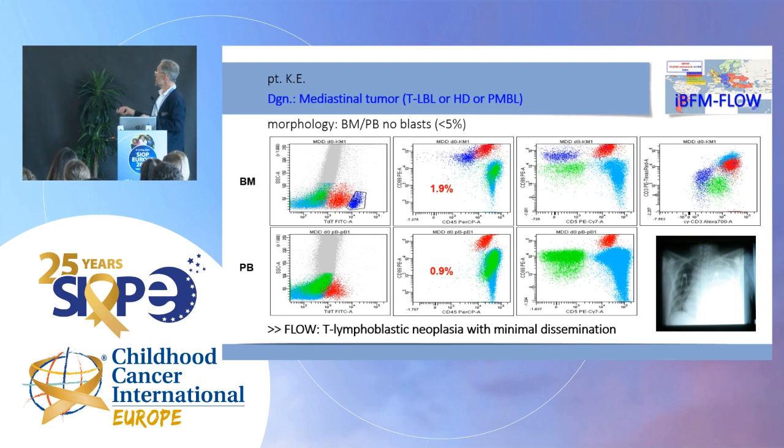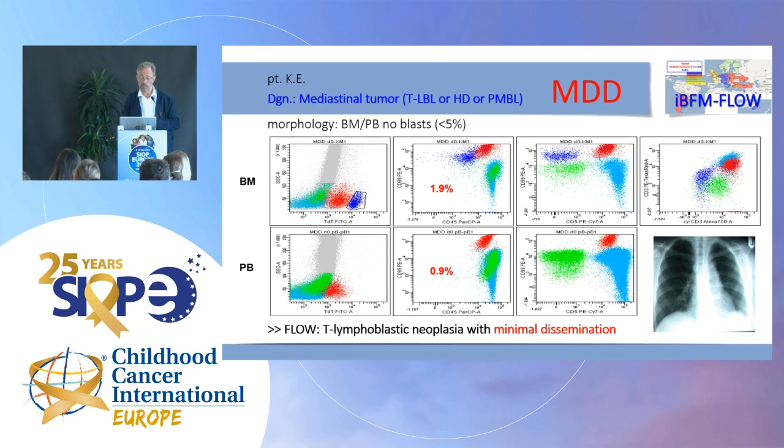So I'm not saying do it with each and every patient, don't puncture them, don't make a biopsy, I'm not saying this. But in a special situation where there is this threatening clinical situation, Friday afternoon, it's better to do it like this. And the patient cleared within a week, as we all know. Steroids are fantastic. If you say then, okay, we do the histology on Monday, you will be too late. But we did it by flow.